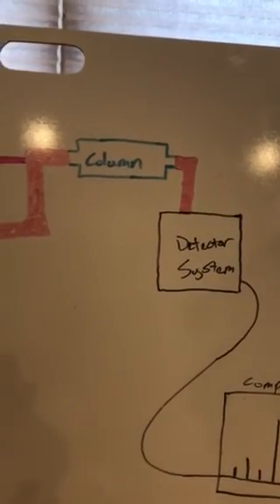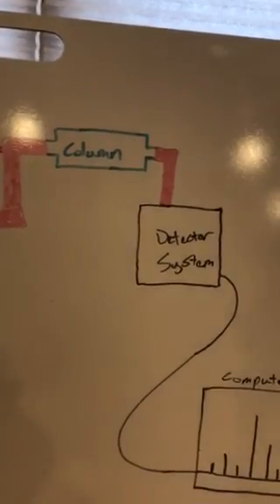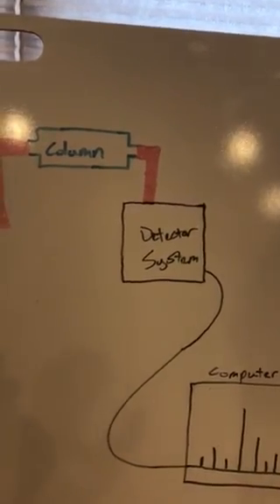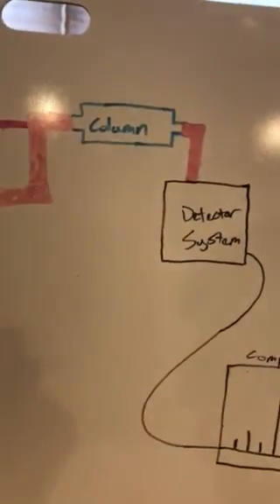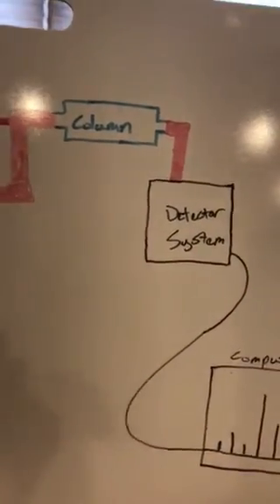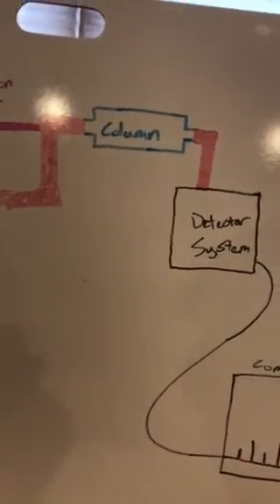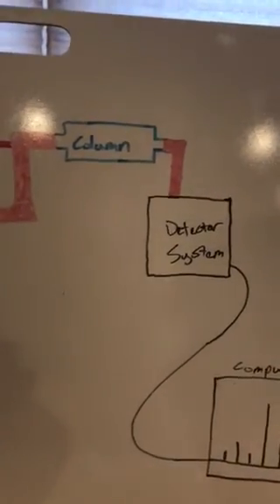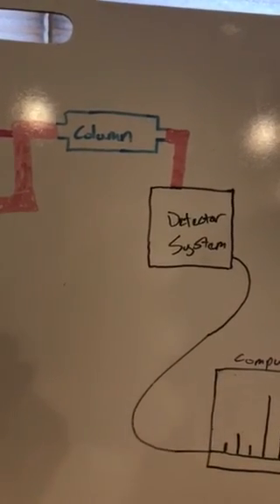It allows us to put a potential difference across an area, and so as our solvent droplets pass through that area, charges will surround solvent droplets, and as the solvent evaporates, the charges are able to softly break apart the analytes. The issue with this is that the mass to charge ratio, the charge is not always 1, so that's why we use the tandem mass spec to separate out that single parent ion and view the fragments where the charge is only 1.